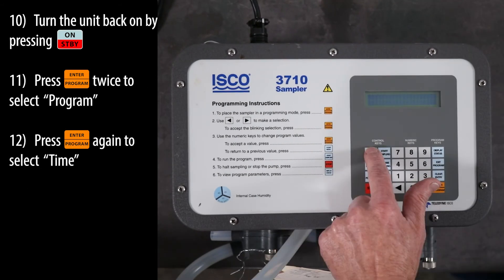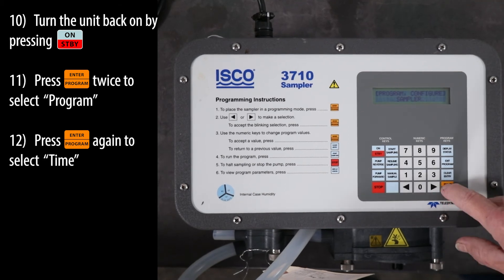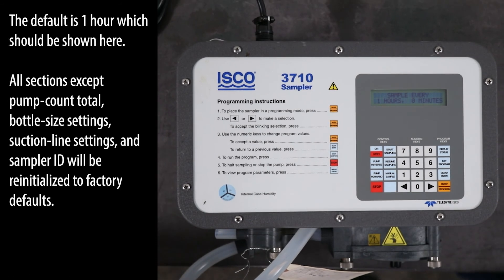Turn the unit back on by pressing the ON standby key. Press the ENTER program key twice to select program. Press the ENTER program key again to select time. The default is one hour, which should be shown here.